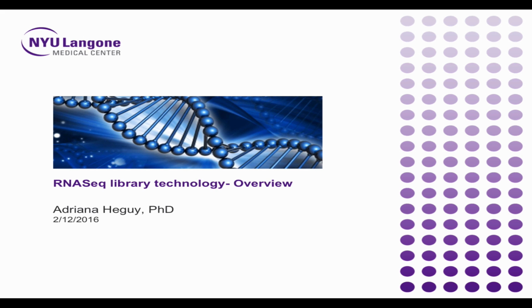Okay, Adriana. All right, thanks Stuart for the introduction. So Stuart told me to keep this brief, so this is going to be very general, but if you have questions, please interrupt me, it's no problem. I would like to also emphasize that it's very important that we talk beforehand because RNA-Seq library preps became this huge thing where there's many different kits, many different ways of doing RNA-Seq, depends on your purpose, what you want to see, what your hypothesis is, and also importantly what your budget is, because some of these RNA-Seq modalities are much more expensive than others.